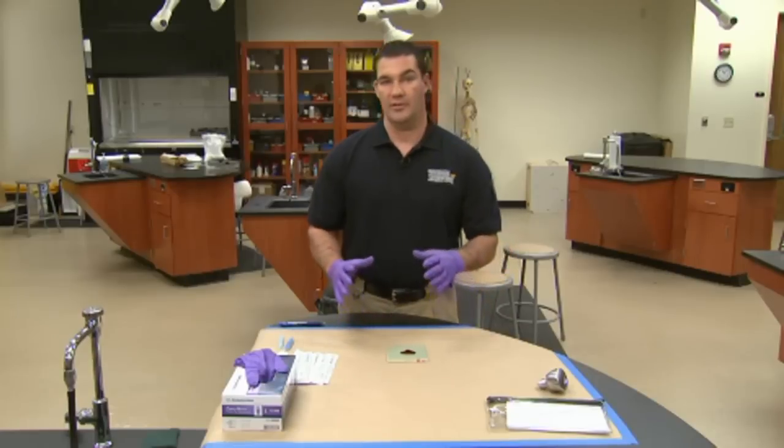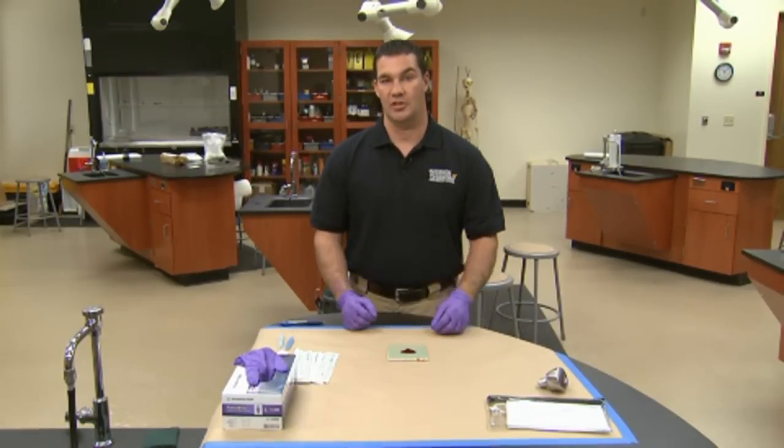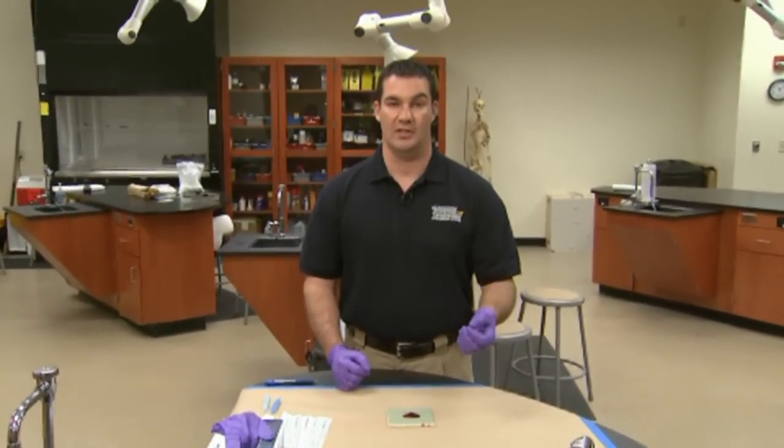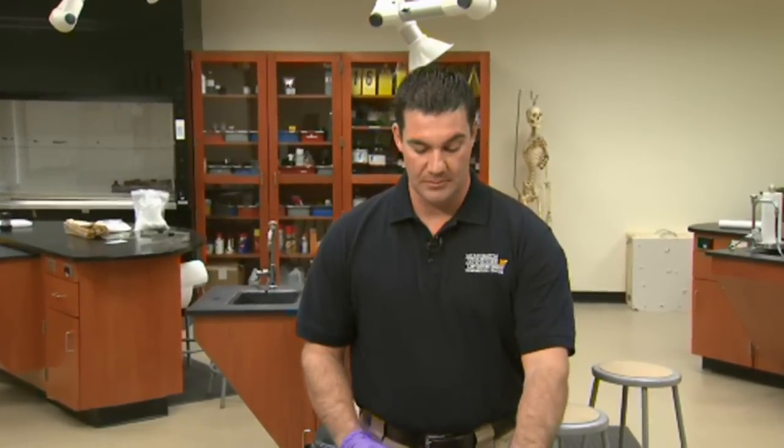So there are really three different types of stains we're going to talk about in this presentation. Although in real life situations there are several others, including things like touch DNA and other scenarios where you may be asked to collect biological evidence. For demonstration purposes, first we're going to discuss the collection of wet blood stains.